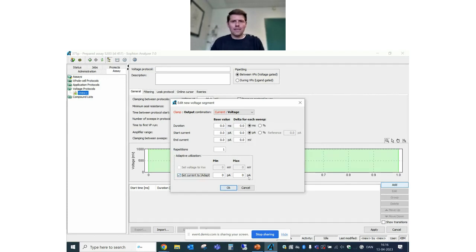And then these are the quality filters that I briefly talked about before. So you can say, I want to apply this adaptive value, but if it is below, for example, -100 picoamps, I don't think it's relevant. Or if it's above 0, I don't think it's relevant. So therefore those should be my limits. And if it falls out of that, then there is a fallback value that could be -5 picoamps, for example. So the cells will either get the adaptive value, but if it falls out of this spectrum, then it will get this fallback value.